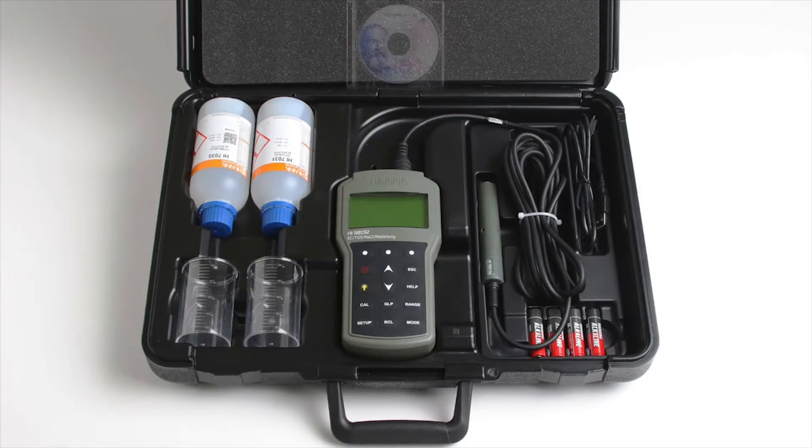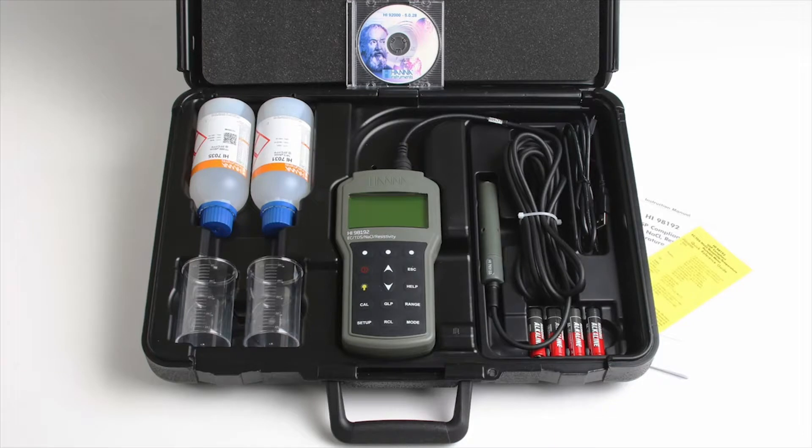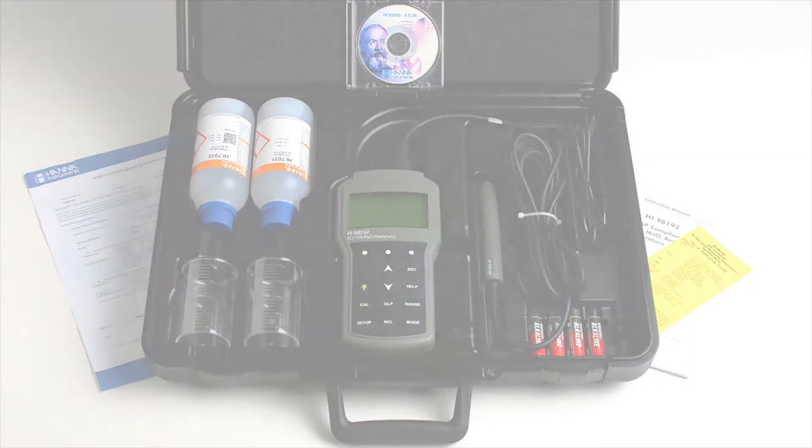One micro-USB cable, Windows-compatible PC software, an instruction manual with quick start guide, and the instrument quality certificate.